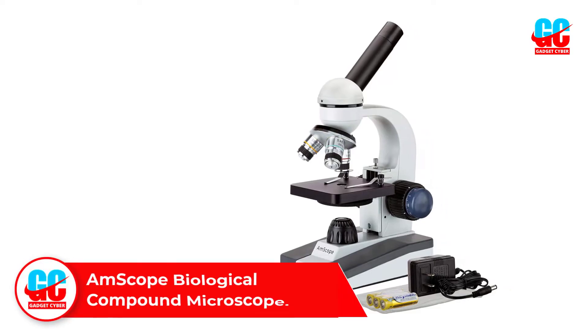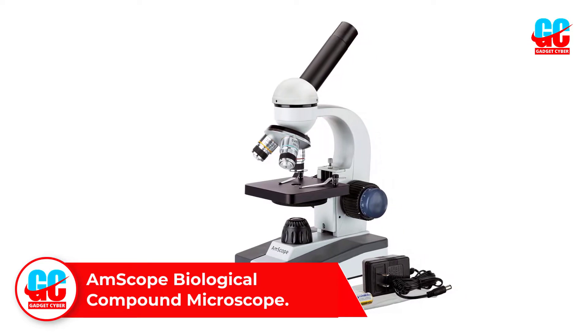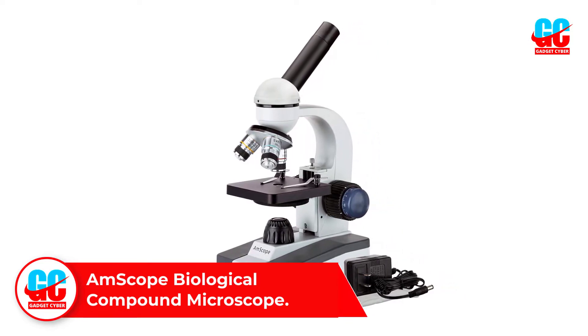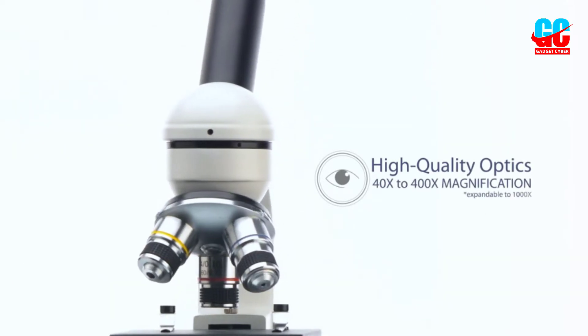Number 1: Amscope Biological Compound Microscope. Ruggedly built and reasonably priced, the Amscope M150CI was our favorite compound microscope overall. The all-metal framework lends to the sturdy feel.